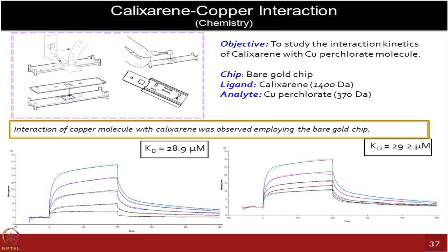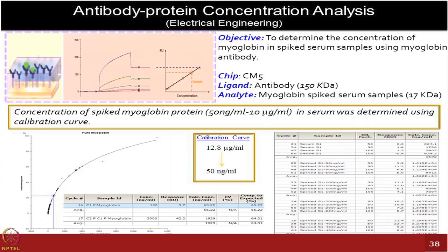This one shows two different experiments, and the KD values obtained are pretty close. That was an interesting experiment for us to try out, because there was no ready-made chip available for it, and still the immobilization was pretty reproducible.